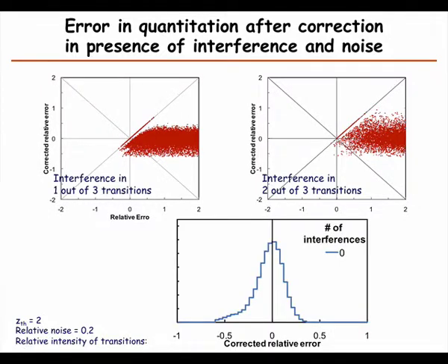So now this is a threshold of 2. If there are 0 interferences, then we introduce this tail by setting the threshold, so we make it slightly asymmetrical. If we have 1 interference, it becomes a slightly wider distribution, and then if you have 2 interferences, it becomes a lot wider. And that's the same as we see here, just looking in this gray area here.